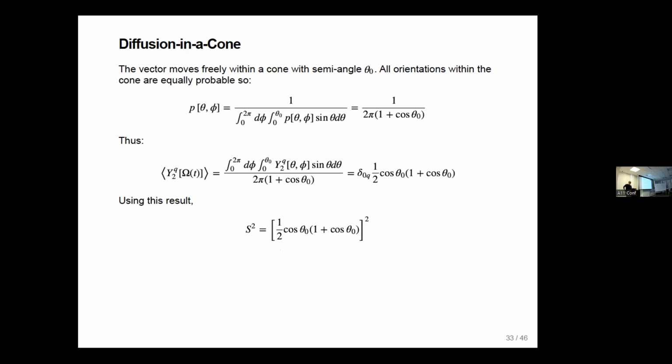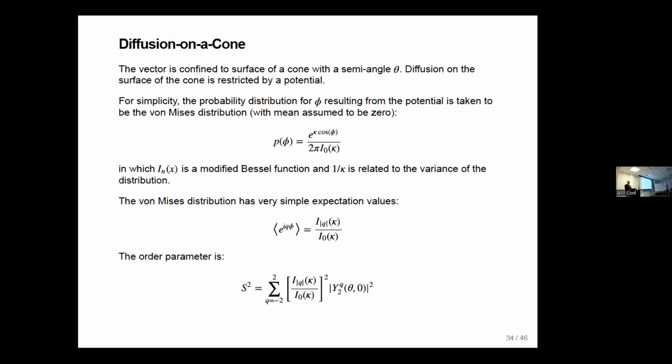Depending on how you do the calculation, it turns out to be just a few degrees, which would make you happy. If you have an alpha helix with the NH hydrogen bond, it's hard to imagine how that deviates by more than a few degrees without breaking the hydrogen bond.